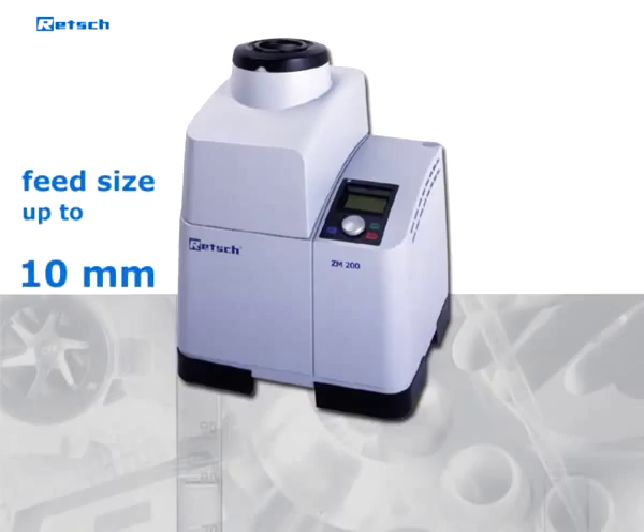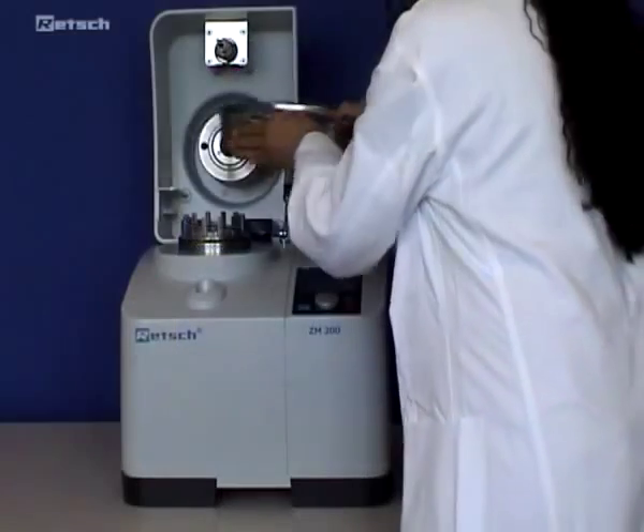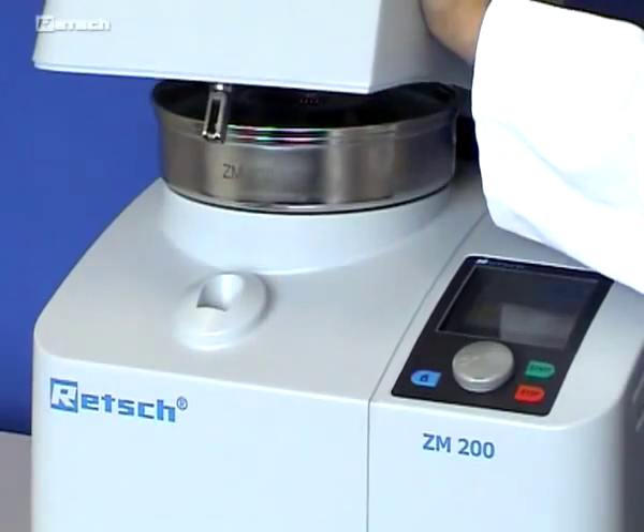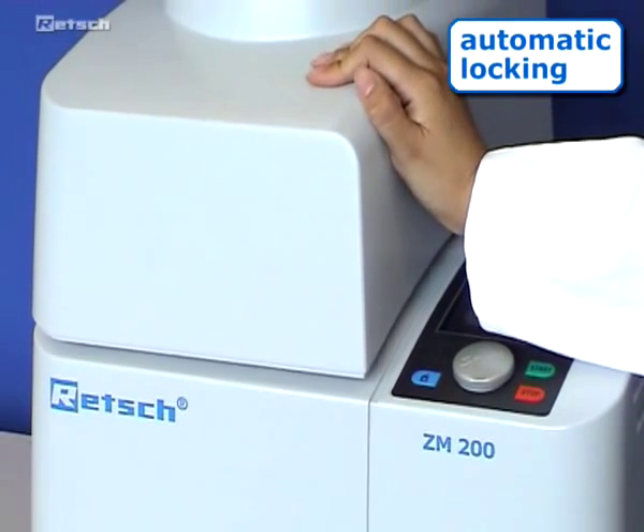With a maximum feed size of up to 10 millimeters, a fineness of down to less than 40 micrometers can be achieved. After placing the cassette together with the sieve, the lid only needs to be pushed down. Locking of the lid takes place automatically.